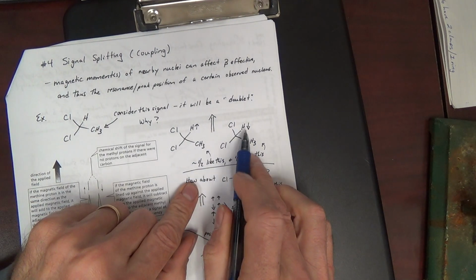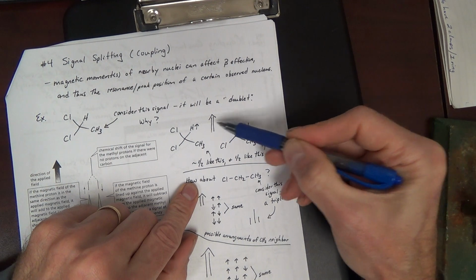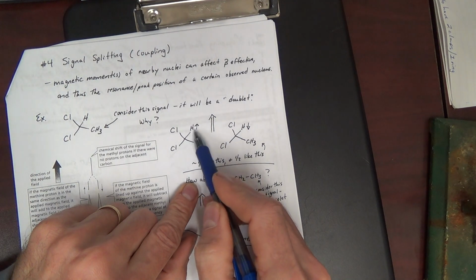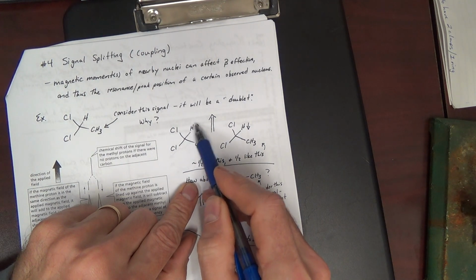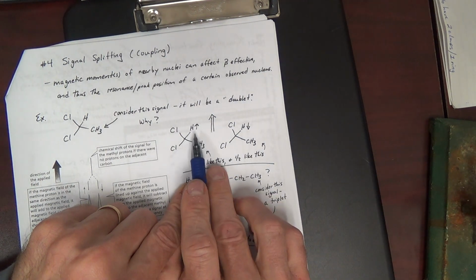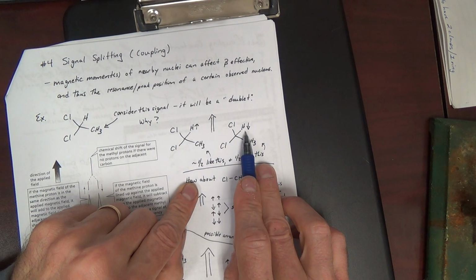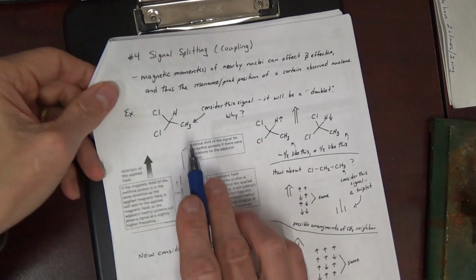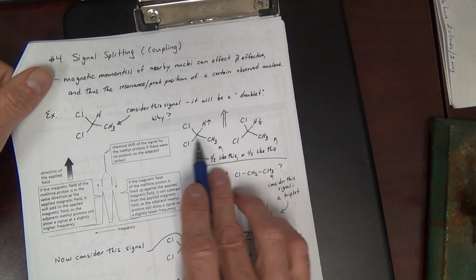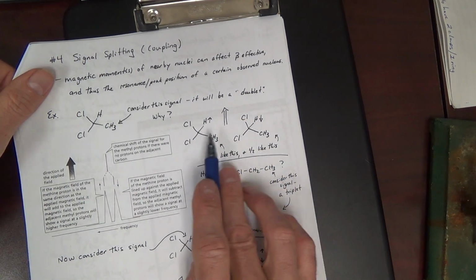Basically, the nearby nuclei can act to shield. This would be shielding the CH3 because it's opposing. And then the opposite of shielding would be de-shielding because this is adding to the external field. Now it turns out that roughly half your molecules exist in this manner and about half exist in this manner. So really when you are doing NMR of this compound, once you put it in the magnet, you have two different situations for the given compound. And this leads to really two different signals.